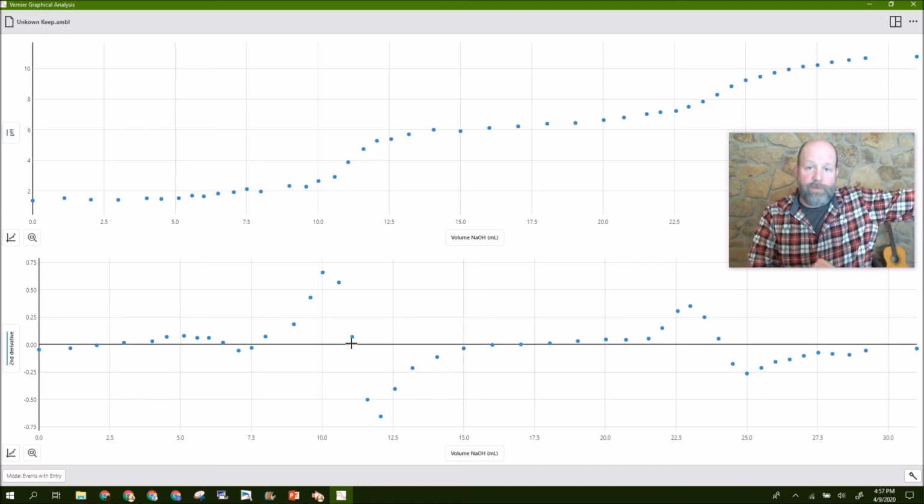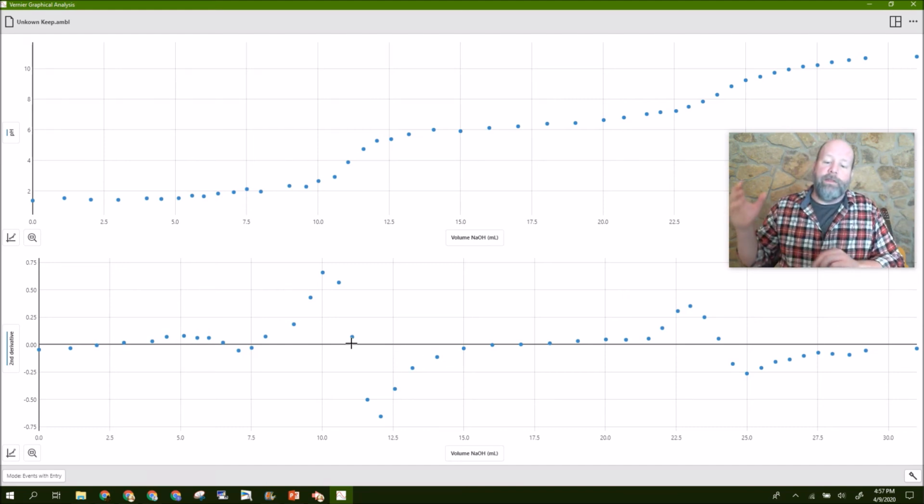we've taken the first proton off of every molecule in there. And then the second equivalence point, now we're adding base to neutralize the second protons, the acid that is there because of the second proton. So you're going to want to subtract whatever the volume you get here minus this volume, and then half of that, and it'll get you somewhere in here. You're going to use that volume to find the pKa for the second proton. So we call this pKa1, pKa2, Ka1, Ka2. What I'm going to ask you for is Ka1 and Ka2. So you should be able to get that from these data.